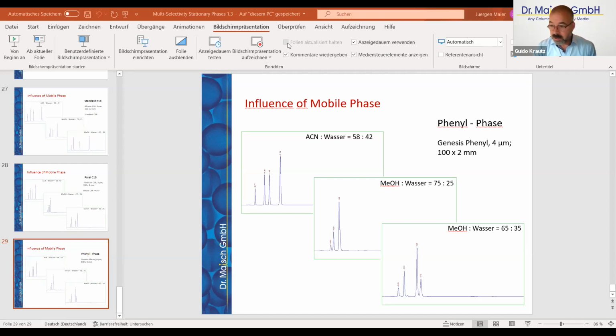I've worked on a few questions during the presentation. There's one open one here. Maybe I'll just read this out to Jürgen. It says lactose and galactose coelute on aminopropyl phases, while on polymeric aminopropyl phases, better separation is achieved. Please suggest a column for this separation.